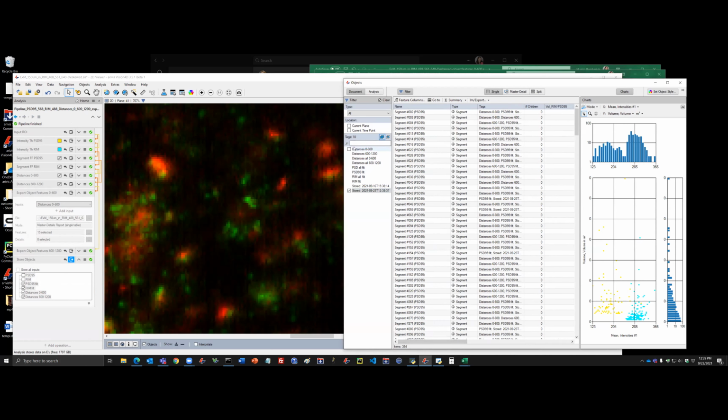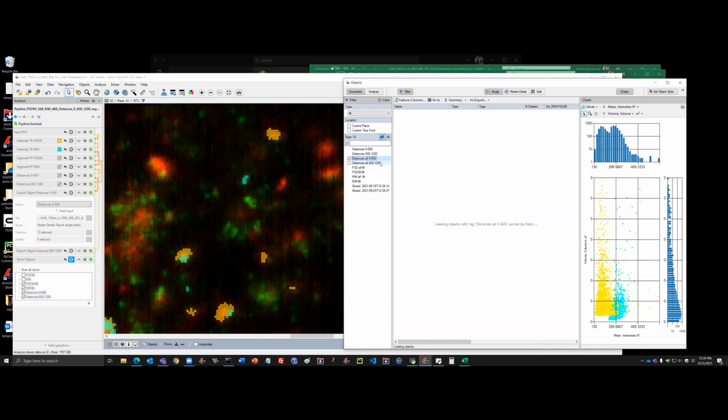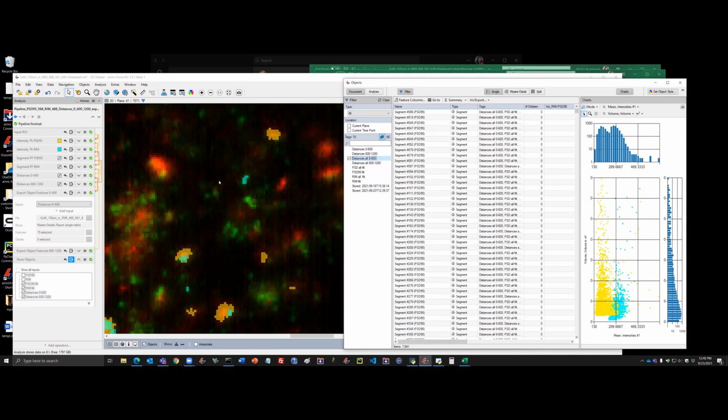And now, because I ran this pipeline before, I actually have it twice, excuse me, for all the particles from earlier for the whole stack. And as Matthias mentioned, the file is pretty large, but this same pipeline on my computer took less than 5 minutes, I believe, to run it. So it's still pretty small actually.